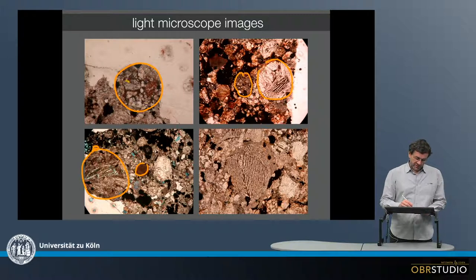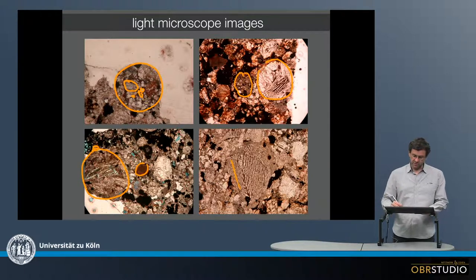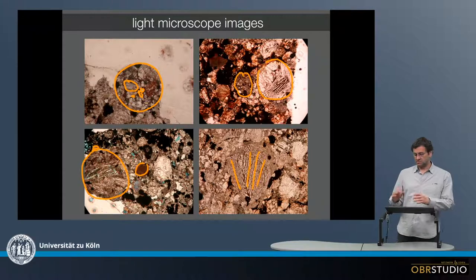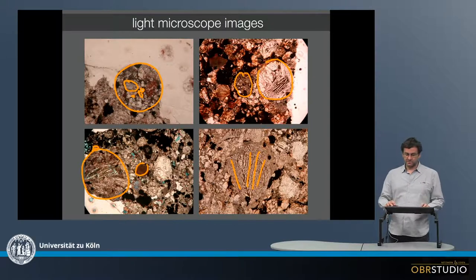We can see that the chondrules contain, in this case, small mineral grains with some black material in between. Or in this chondrule, the minerals are more oriented like bars.